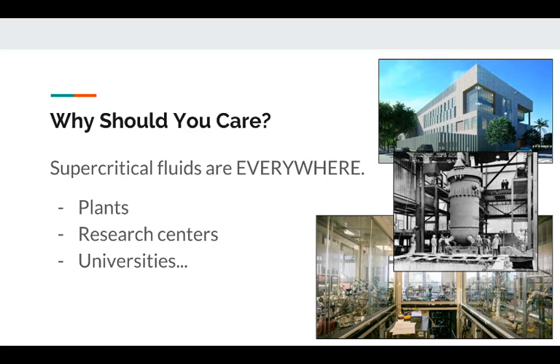And the reason they're so ubiquitous is because supercritical fluids are unparalleled when it comes to extracting high volumes of very high quality product from a feedstock. That being said, there are downsides to using these fluids, and the main one is the additional safety elements that are required when actually using one of these fluids for extraction. We can see an example of this, even at small scales.